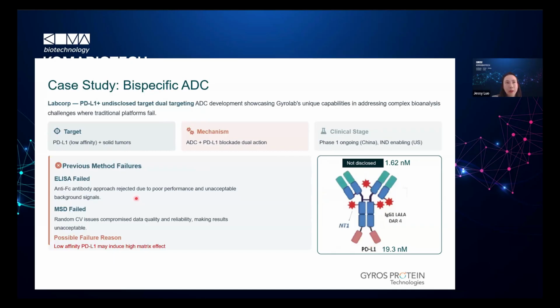But on ELISA, they can only capture one from this part, and the other one from that part. This method was rejected because they also got a previous challenge from the regulator. So that's why they said they need to capture the 2 targets.